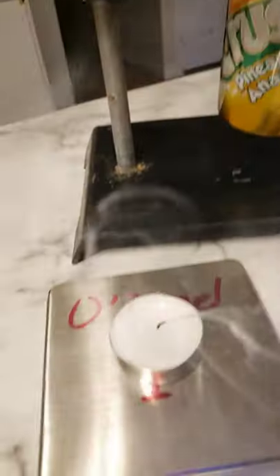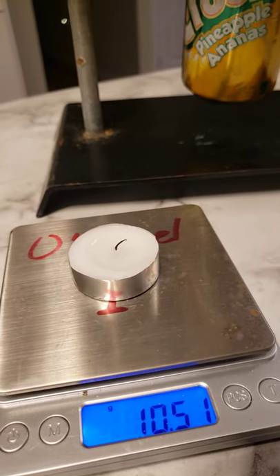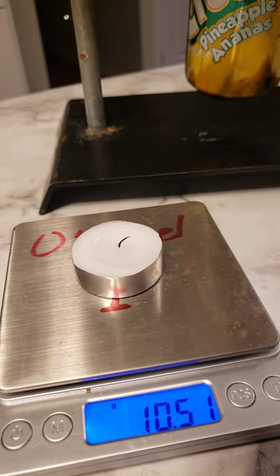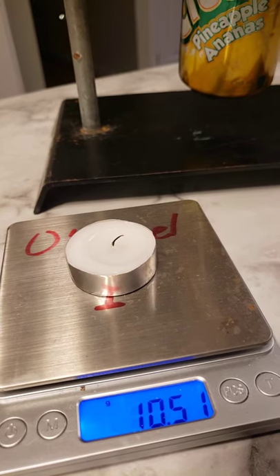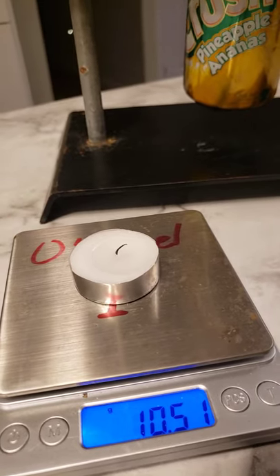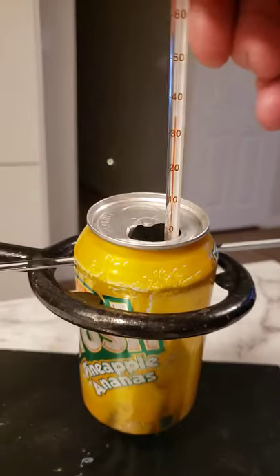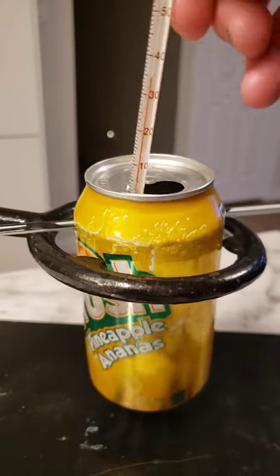I'll get the mass of the candle after the experiment has been running for a few minutes. 10.51 grams is my final mass here, as I stir the water in the so-called calorimeter.